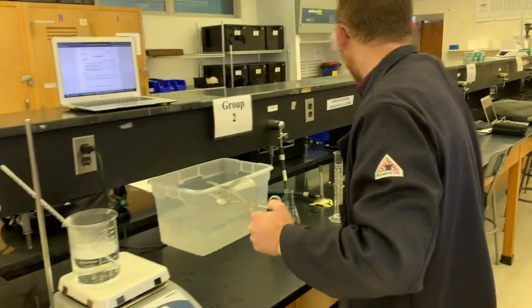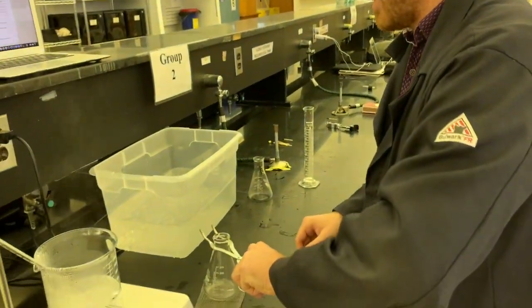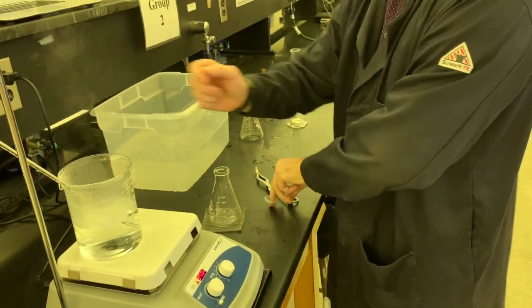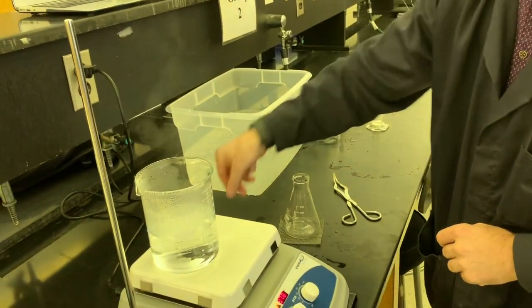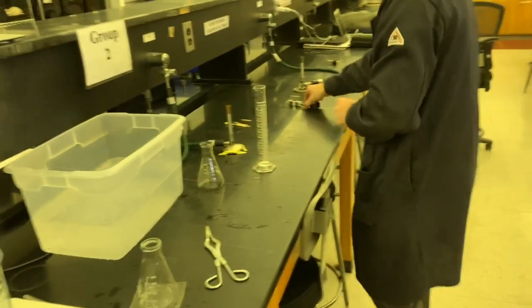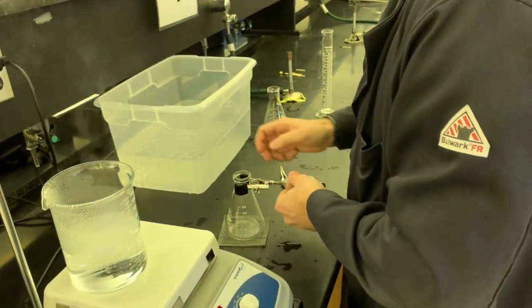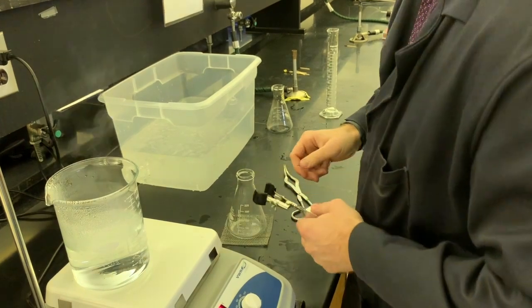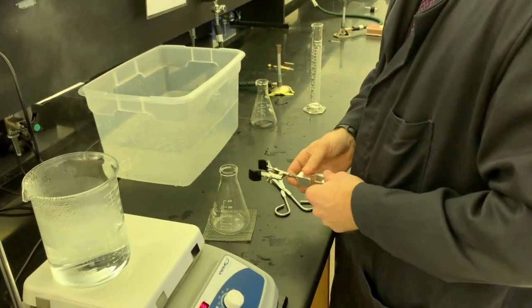So what we're going to do once we have our flask heated up is sit it down for a second, and we're going to go to our water bath, which we've heated beforehand, and place this flask in a clamp. If it's too hot, you might actually burn a little bit of plastic onto that flask.